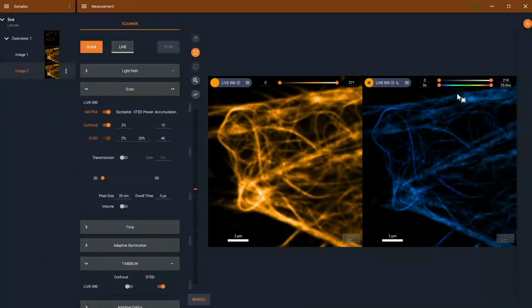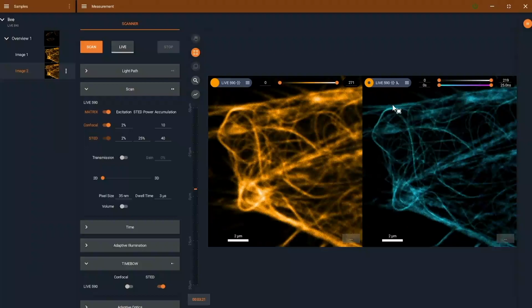So just do it again. And right now we see the intensity plot here on our STED image. I use the 2 color code and start to adapt the longer lifetime, which is here in magenta and staining actin, and the shorter one is in cyan, showing tubulin right now here.